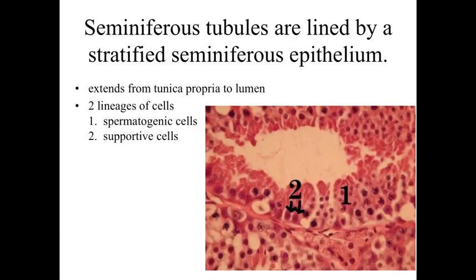At much higher magnification, what we're going to see within the testes is the seminiferous tubules. What we've got here is a lumen — that's the inside of the seminiferous tubule — and it's going to be lined by a very specialized epithelium referred to as a stratified seminiferous epithelium. We can see the lumen and many cell layers thick. We're going to have a basal lamina, and this region is going to be referred to as the tunica propria, which is essentially just the base layer found with this epithelium.